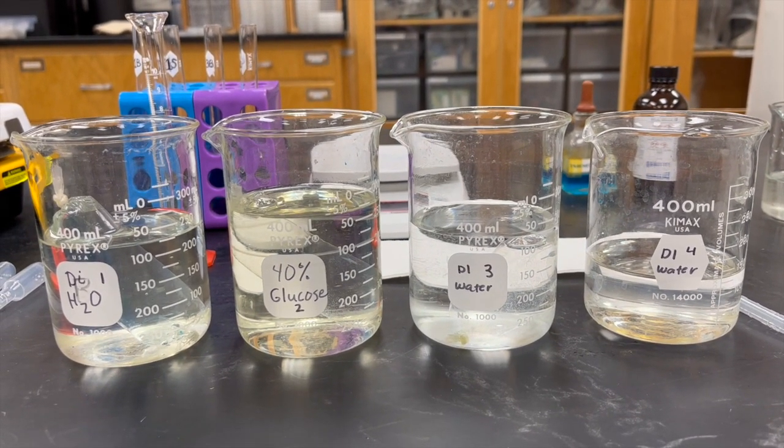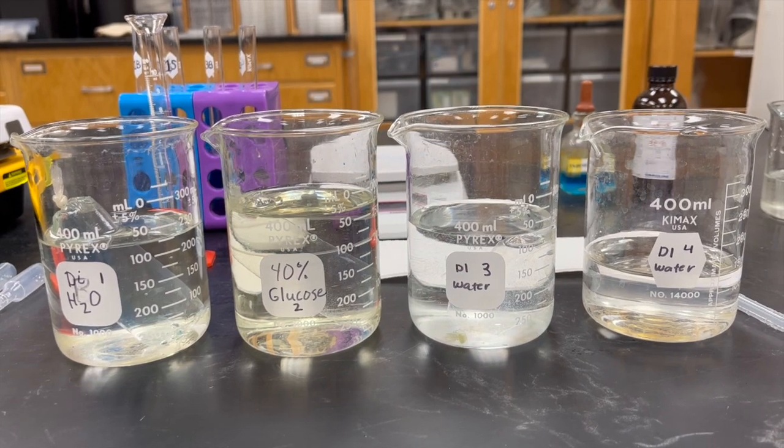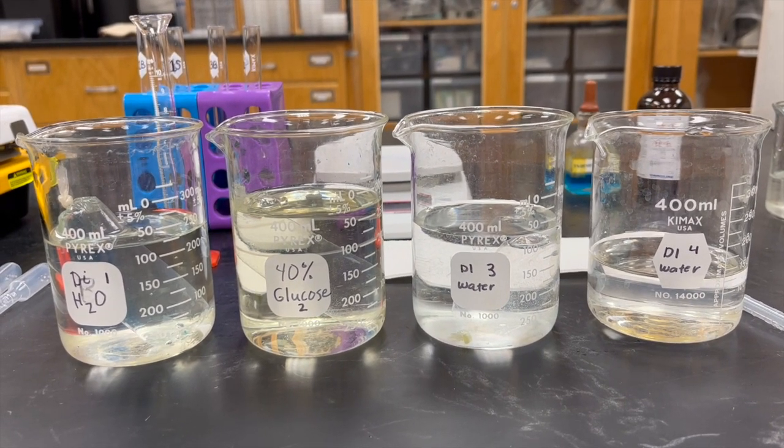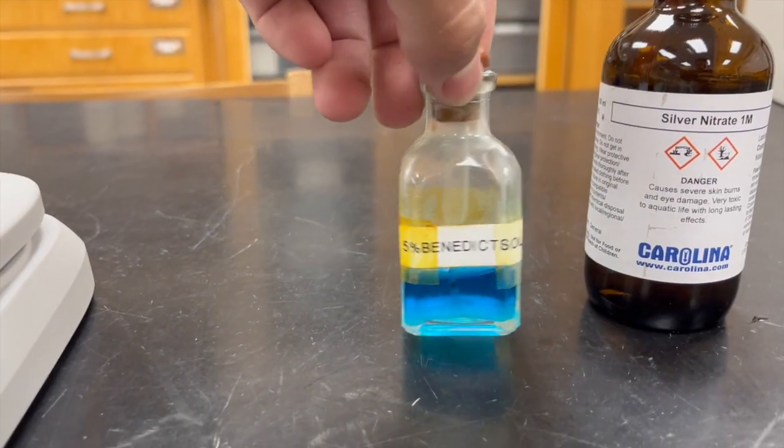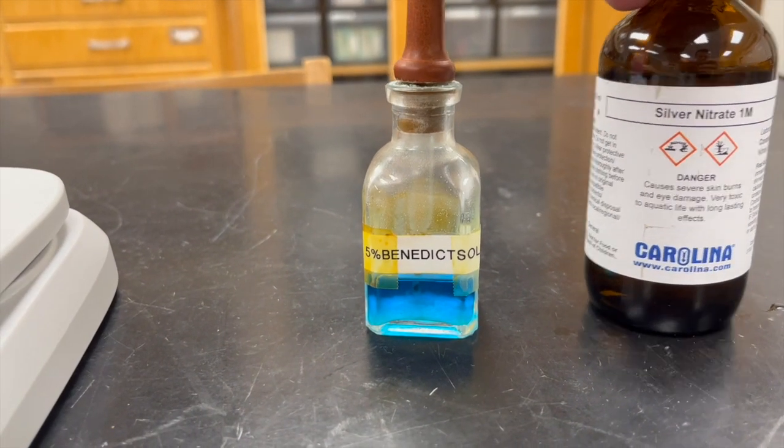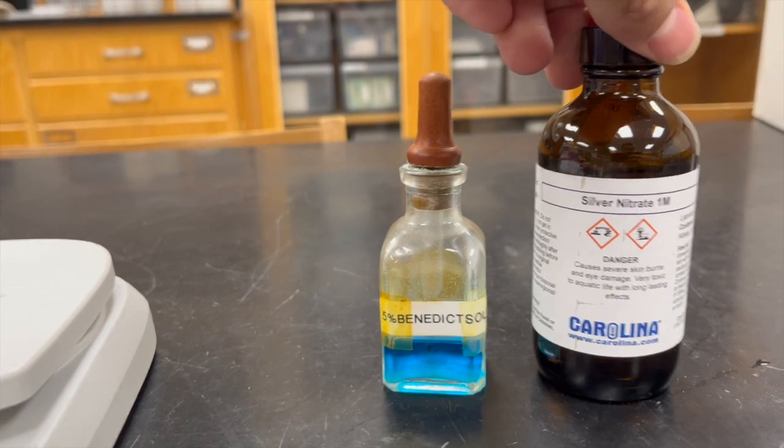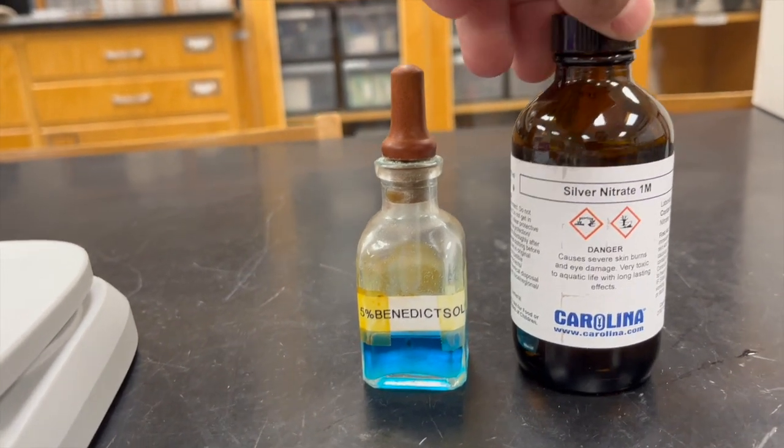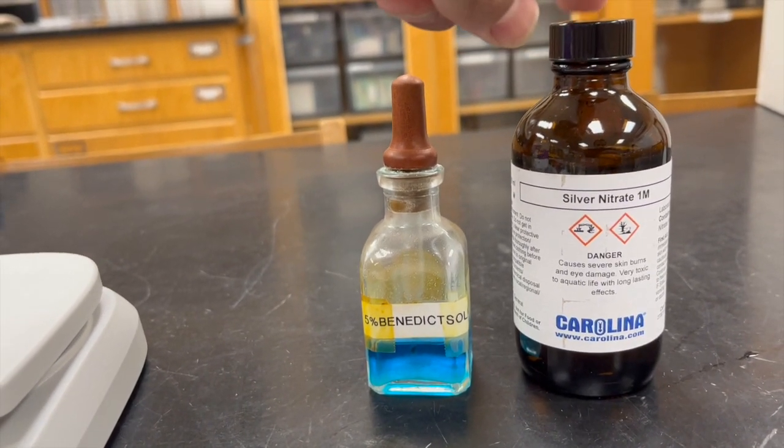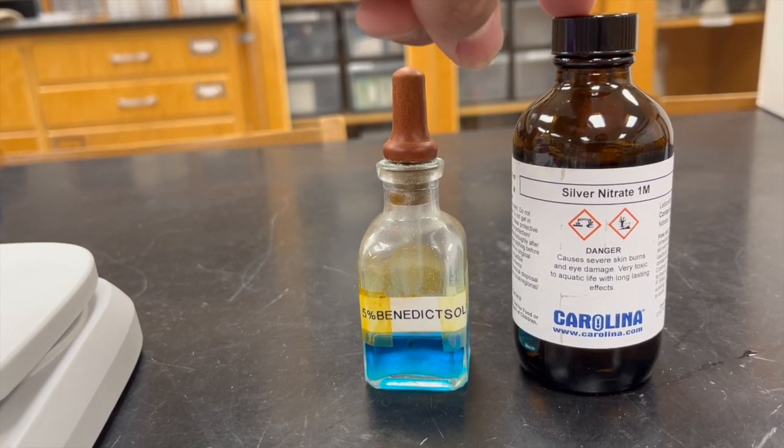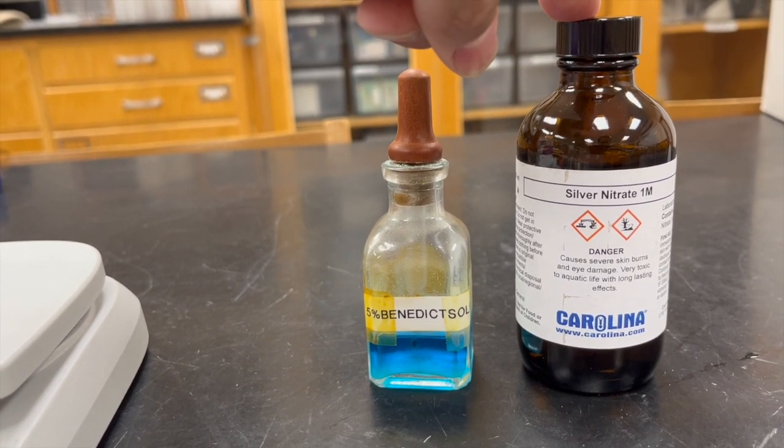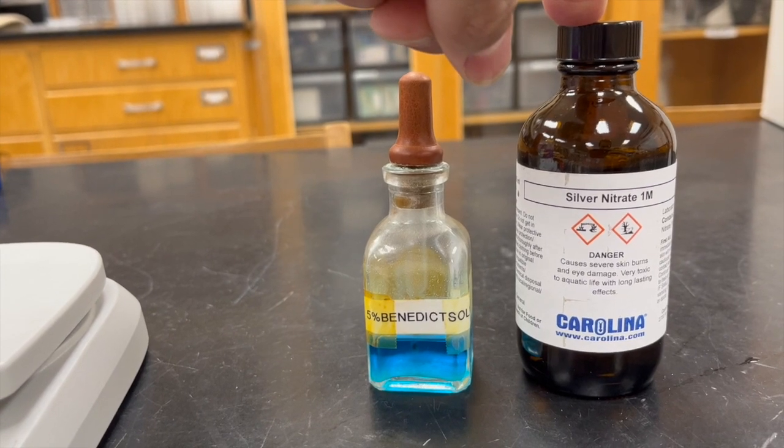After the hour is up, we're going to test for the presence of sugars and then test for the presence of salt within each of these different test tubes. Benedict's tests for the presence of sugar. Silver nitrate is what tests for salts. This is a one molar solution, so you'll add 3 milliliters of this into 100 milliliters of DI water.